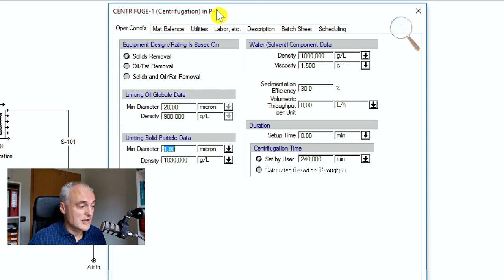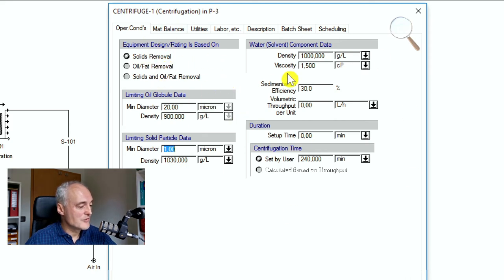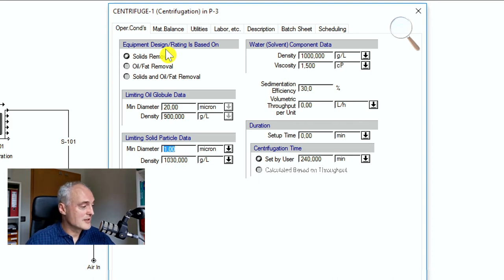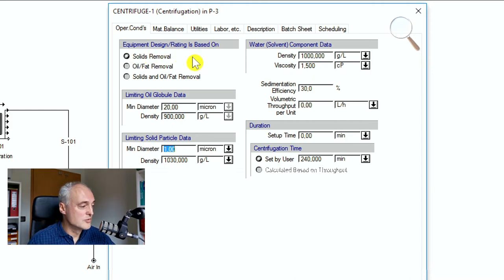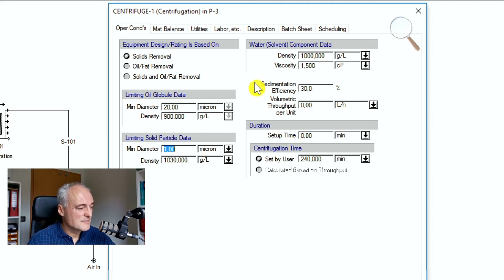We need to initialize the operation. The screen looks different from what you've seen before — each new unit has different operator conditions and texts. Equipment design is based on solids removal; we don't want to remove oil or fat, just solids. There is no oily phase in this case.